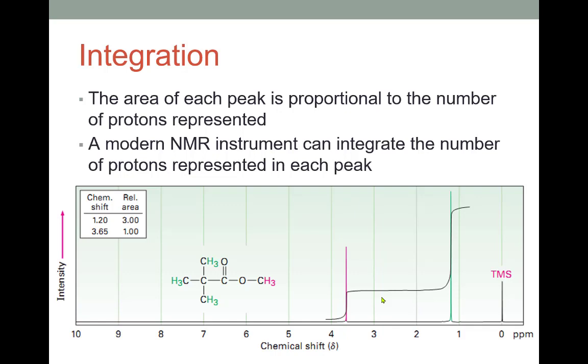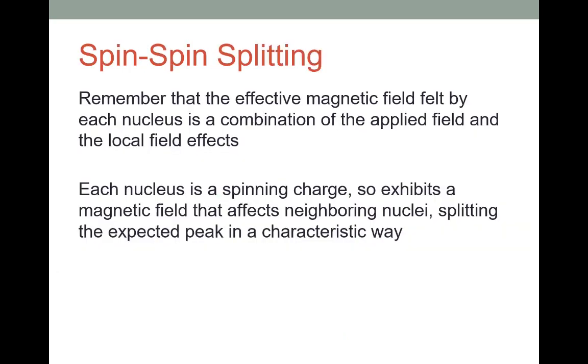So far, this looks very much like carbon NMR. So far, we're talking about shielding and electronegativity and determining structure. Proton NMR gives us a little bit more information as well, and this comes in the form of those signals becoming split.